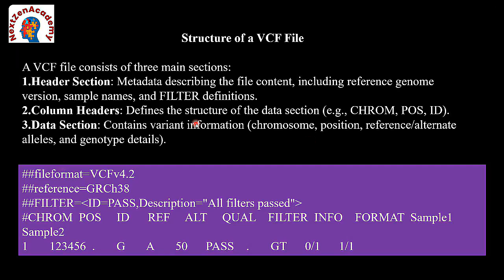Reference, sample 1, sample 2: we need to combine them into a single file, and then perform joint genotyping, generating a unified VCF containing genotypes across all the samples. To do that we do joint genotyping, take the output from the previous step, and apply filters to that set of data.